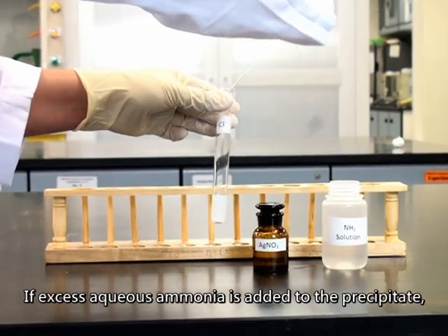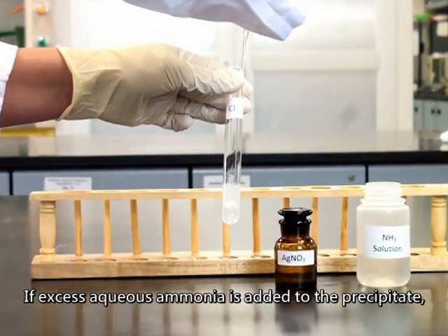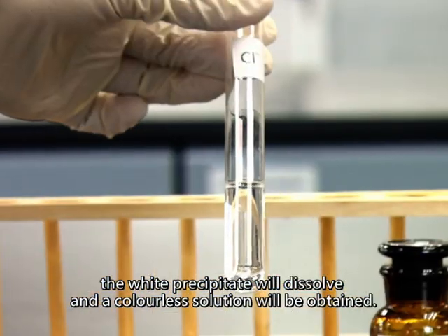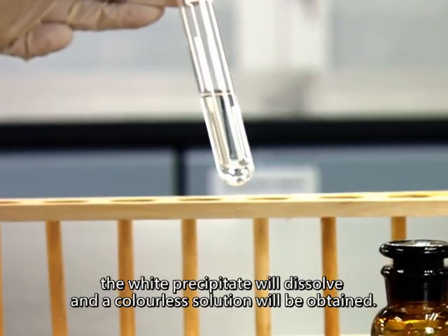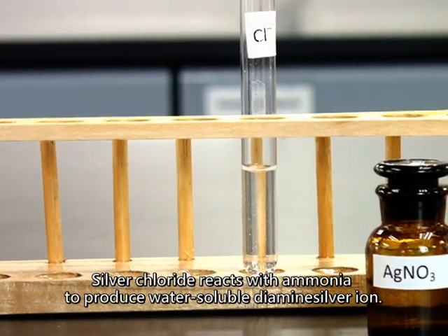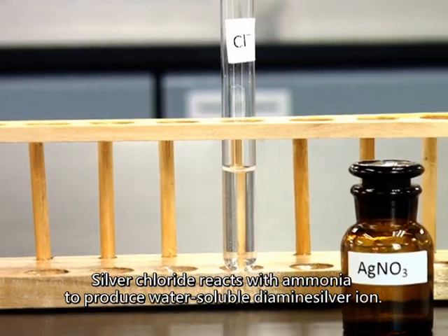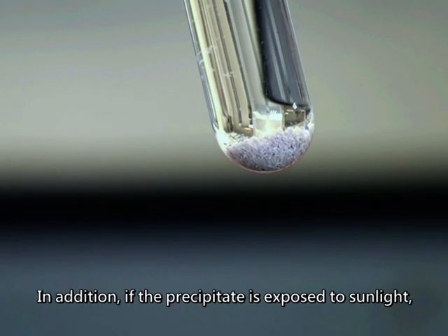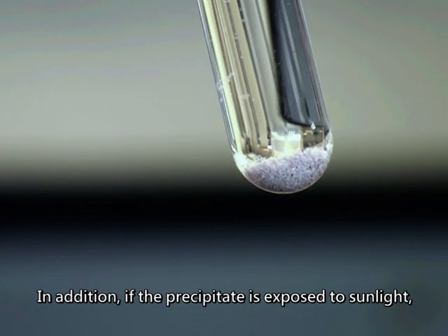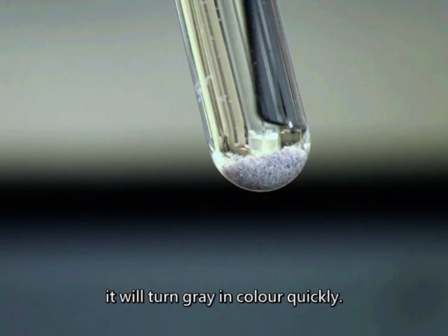If excess aqueous ammonia solution is added to the precipitate, the white precipitate will dissolve and a colorless solution will be obtained. Silver chloride reacts with ammonia to produce water-soluble diamine silver ion. In addition, if the precipitate is exposed to sunlight, it will turn gray in color quickly.